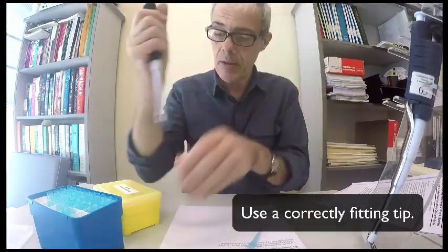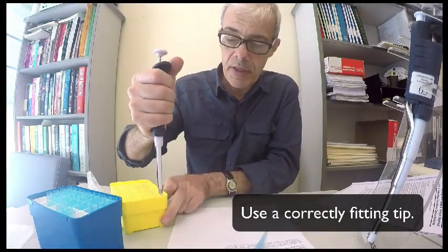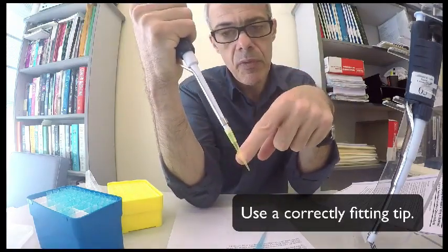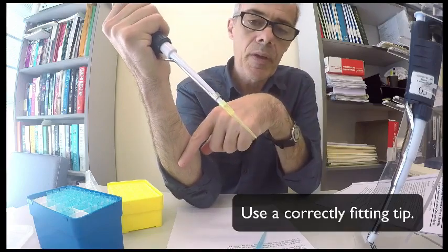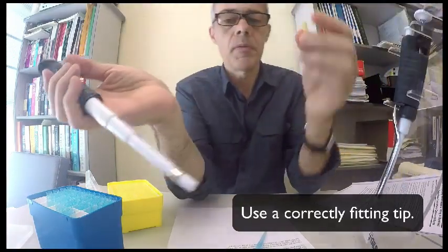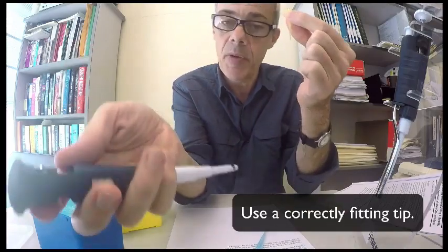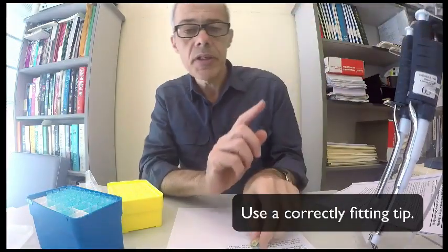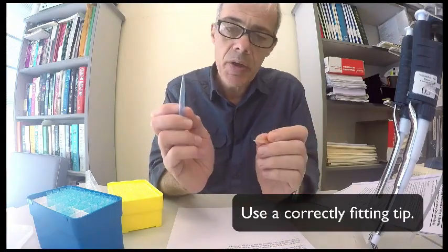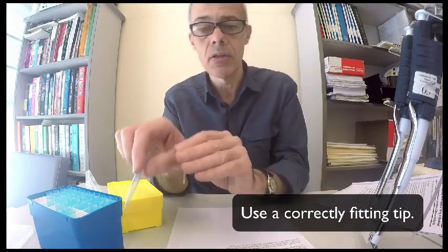Clearly, that is not designed to fit, right? And likewise, the P200 perfectly fits these yellow tips, okay? So here you have one of the yellow tips. And again, the yellow tip isn't anywhere close to fitting the P1000. So when you use these pipettes, you only ever use them when the tip is attached, and it's only the tip that you're going to immerse into the solution that you're going to transfer from one container to another container.